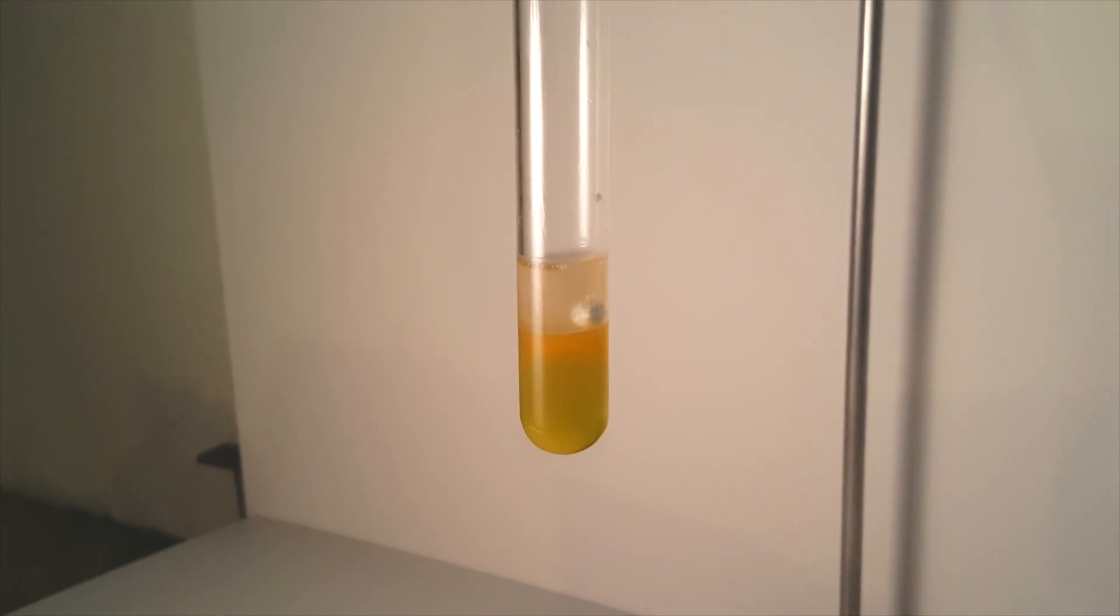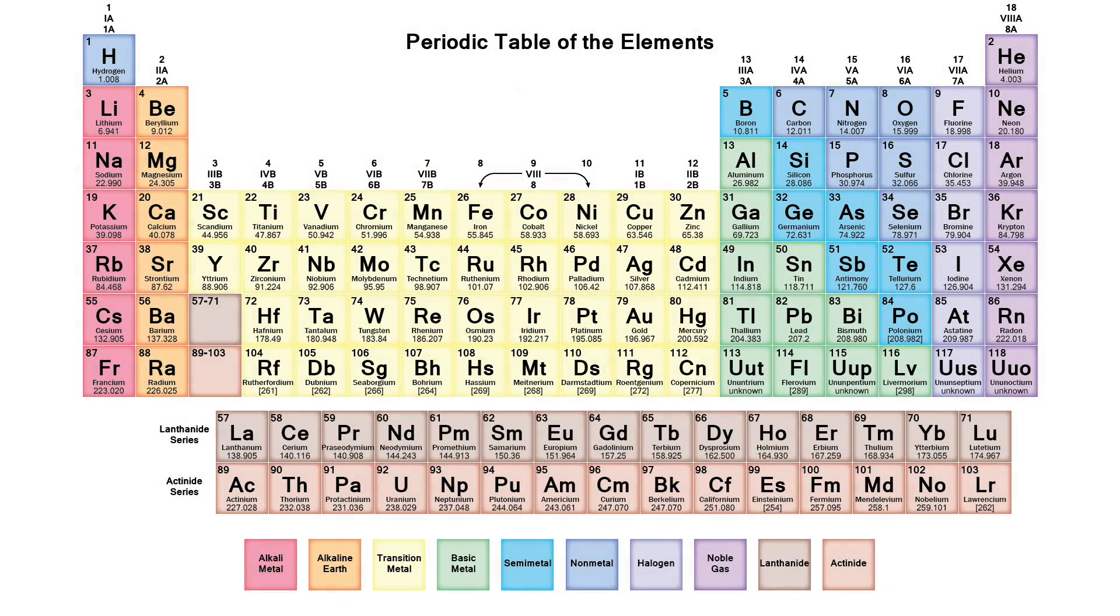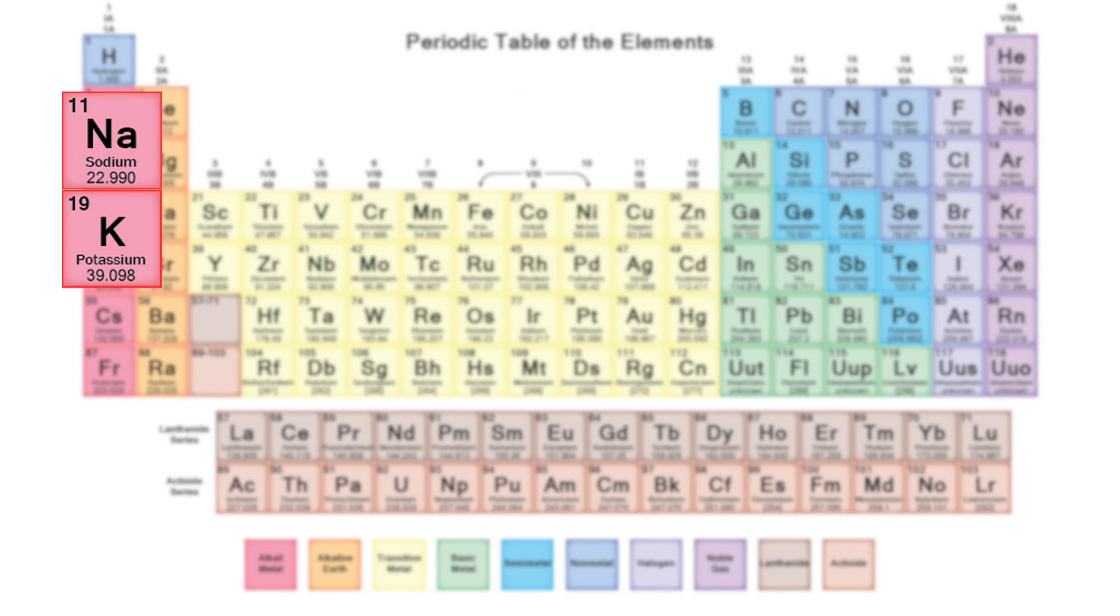Today I'll be trying to recreate the so-called jumping sodium reaction. I use both sodium and potassium metals in this demonstration to observe the effects of each.